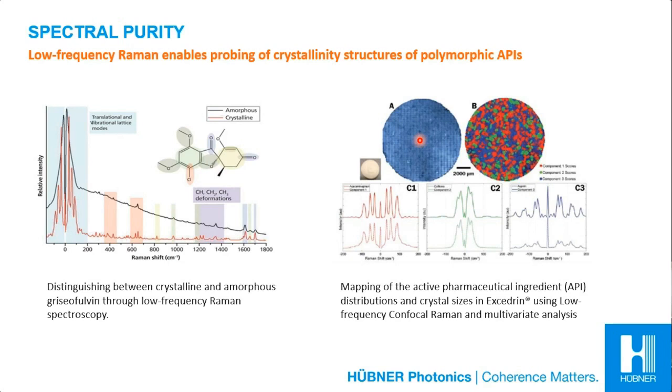They also noted that thanks to advancements in narrow linewidth laser sources and notch filters, they are seeing that low-frequency Raman investigations of pharmaceuticals are starting to transition from the academic laboratories and into pharmaceutical labs and production lines.